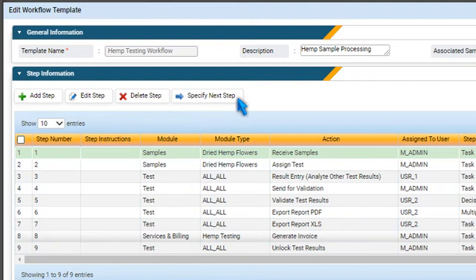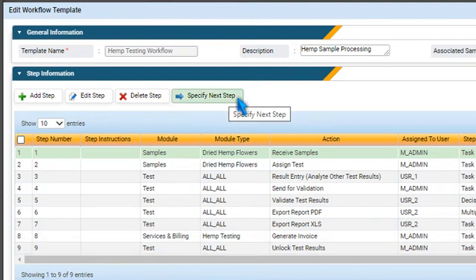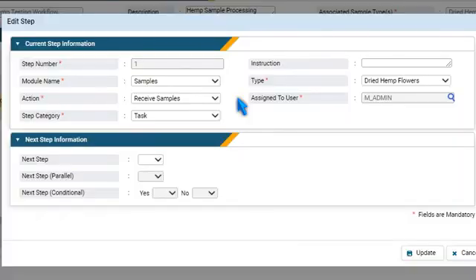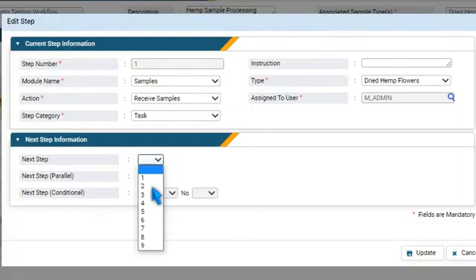For each step, you can specify the next step. Select a step, press Specify Next Step, choose the next step, and press Update.